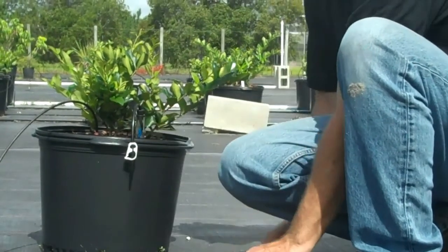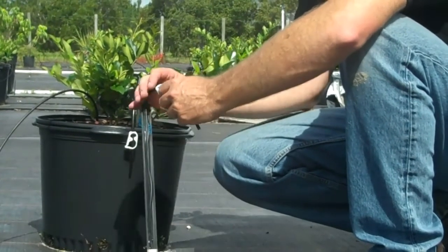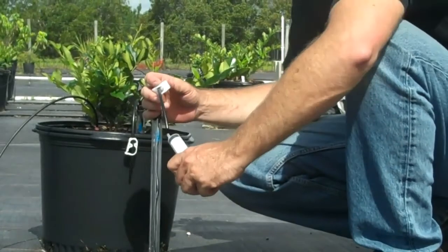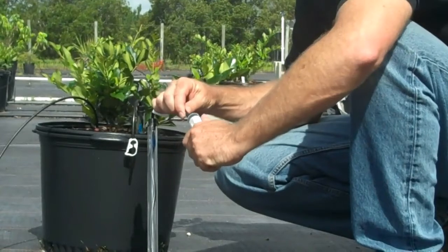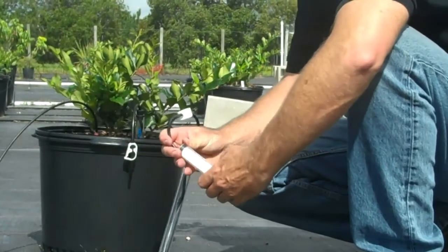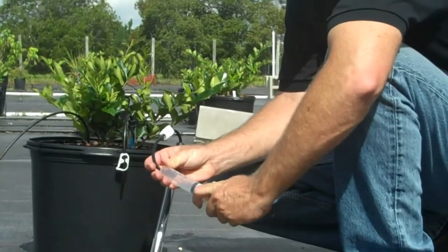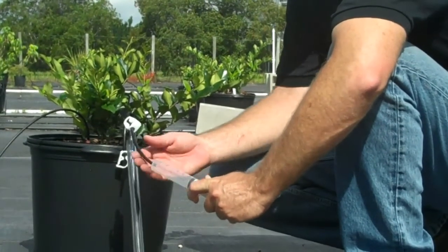After we've pulled the pressure, we've let it sit, and it's collected the water, what you can do is attach your syringe, open your crimp to allow the water to escape, and pull on your suction and collect the water. Now this water is from the pot, so you can measure your EC and your pH that way.